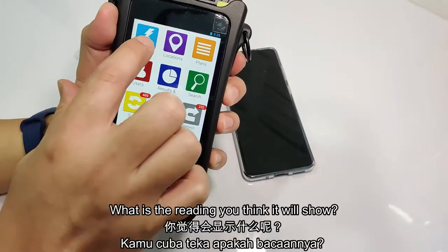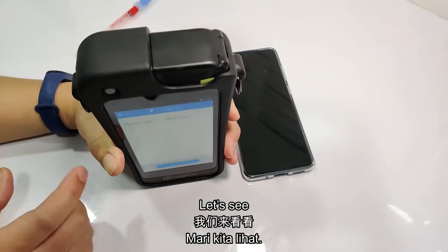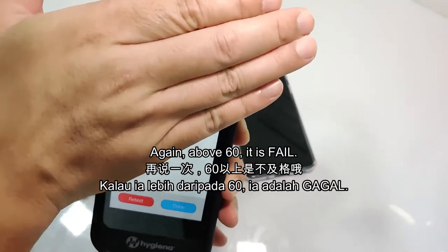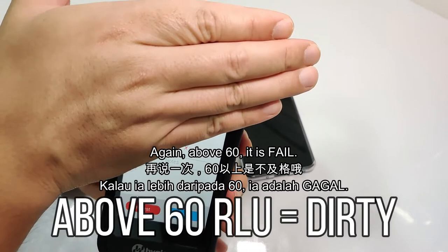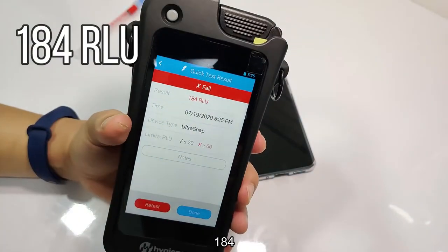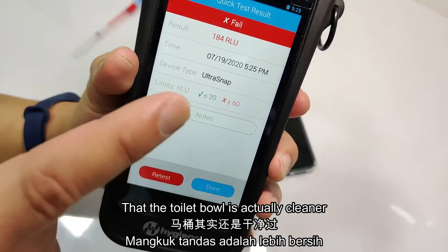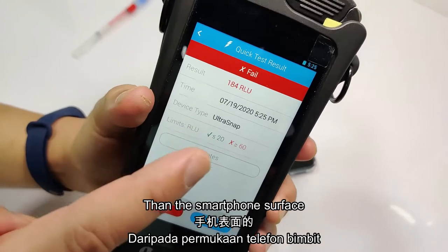What is the reading that you think it will show? Maybe below 100? Let's see. Okay, above 60 is failed. Let's see — 184! Oh my God, it's more than 160. So we have proven that the toilet bowl is actually cleaner than the smartphone surface.